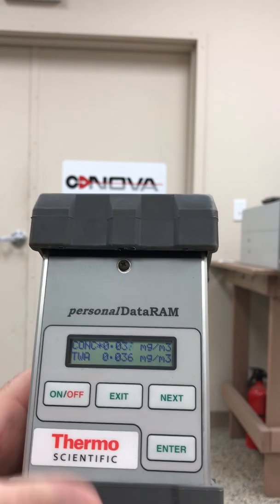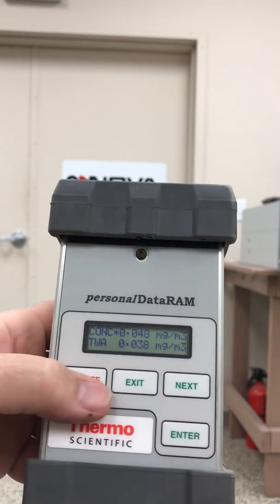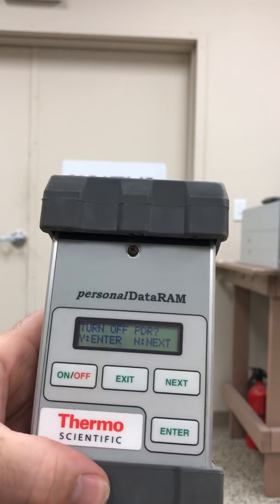So very simple unit, very compact, very easy to operate. I want to turn it off — press enter.